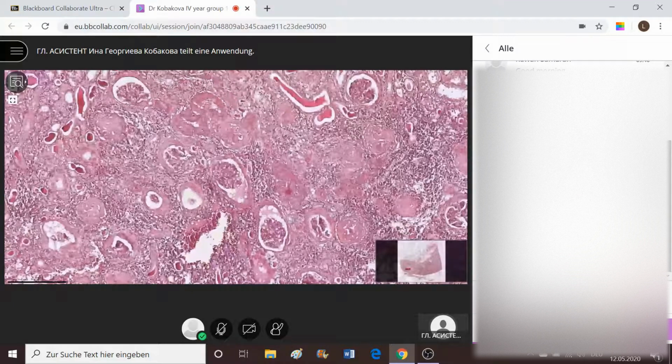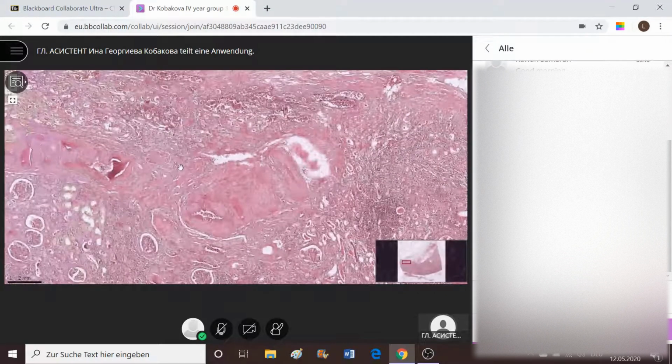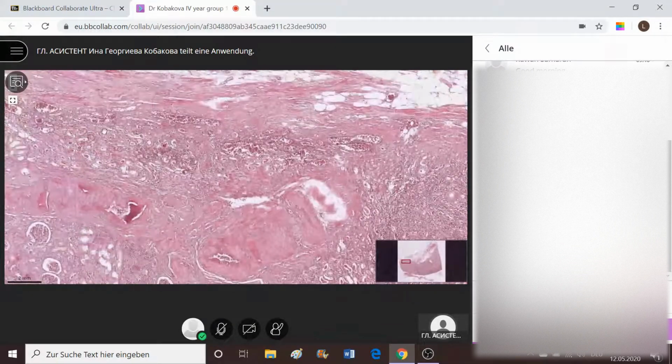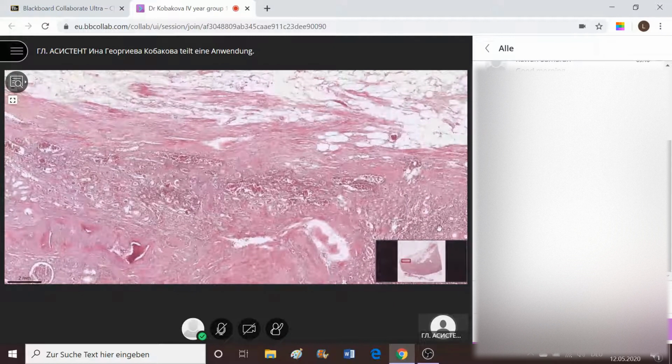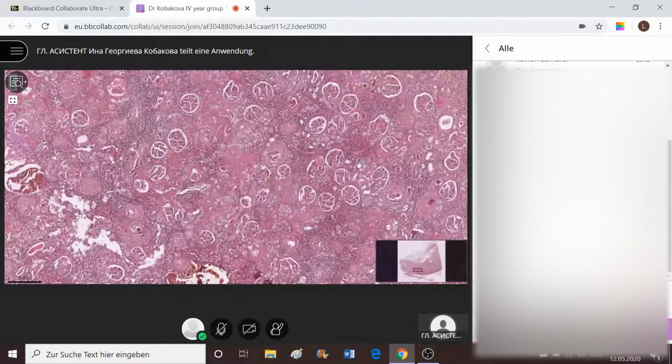So this field is marked as stromization, this field as fibrosis, this field as inflammation, lots of hyalinized glomeruli, and reduction of tubules, other tubules with protein cast deposits inside, hyperemia, edema, and these circulatory changes also might be observed inside the glomeruli. Pretty much that is what you should describe about chronic glomerulonephritis, which might have started on the base of the acute one, since we observed places, one more, with crescents here.